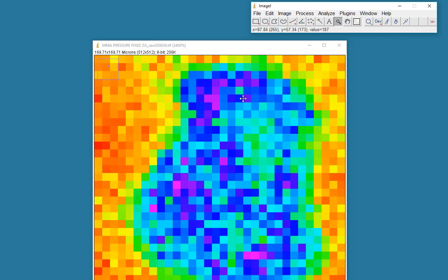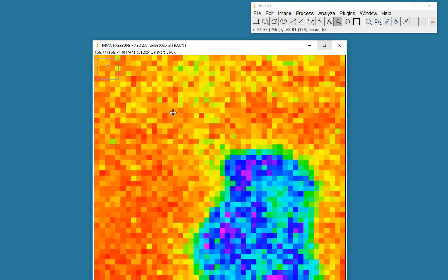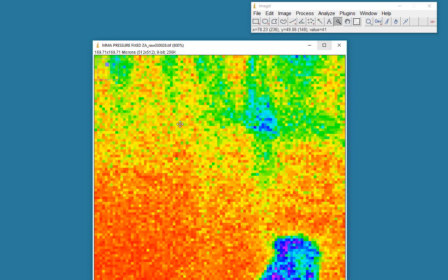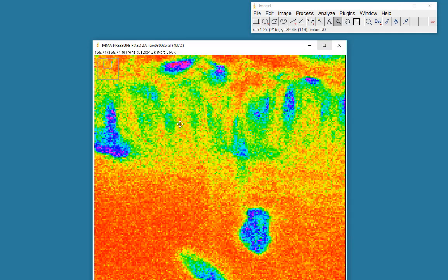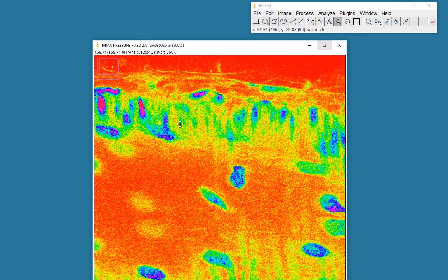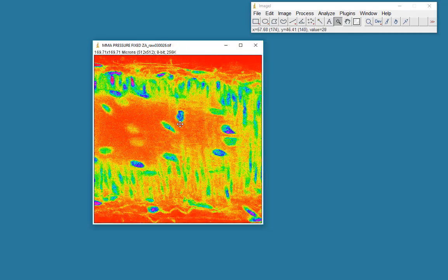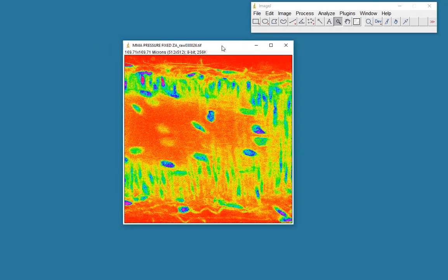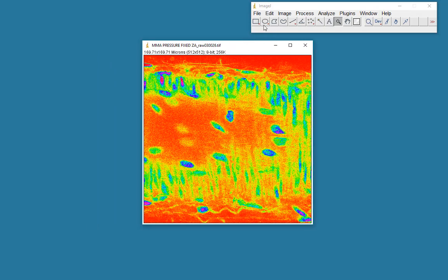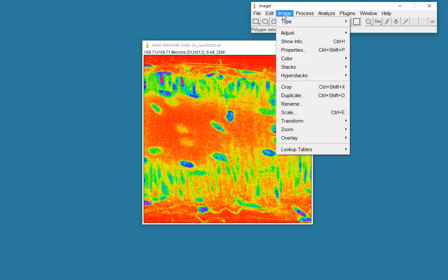If we were to zoom out, again using the magnification tool and the Alt key to zoom out, we see our image in a spectrum lookup table.